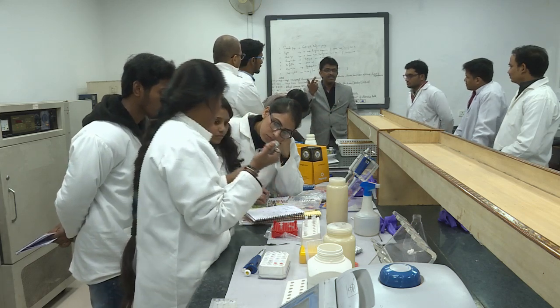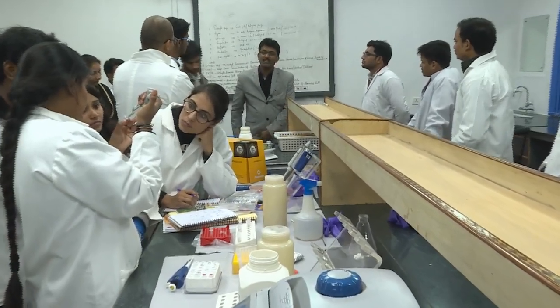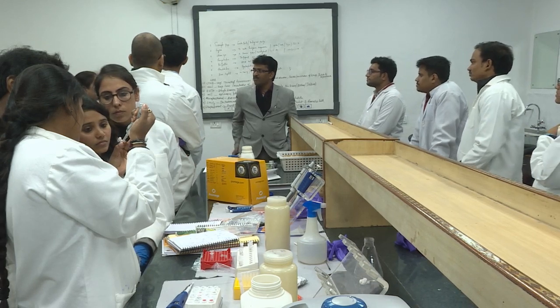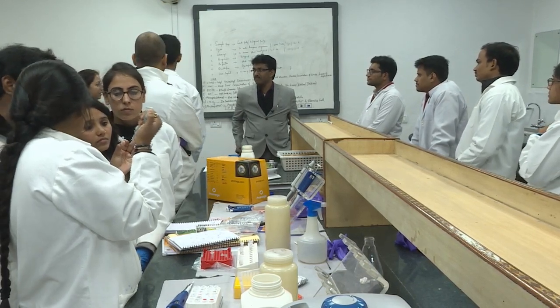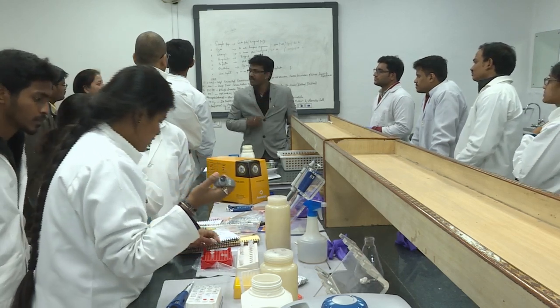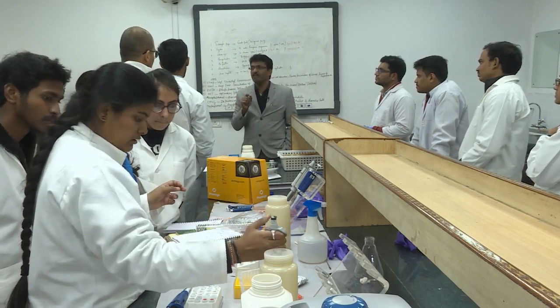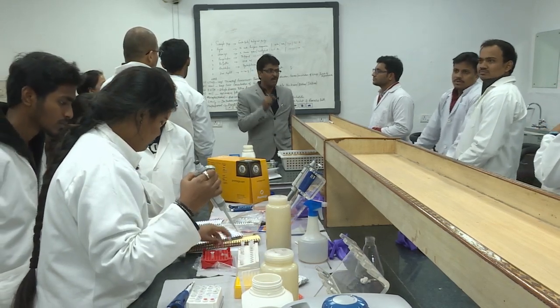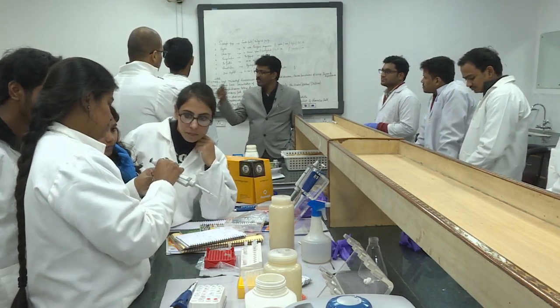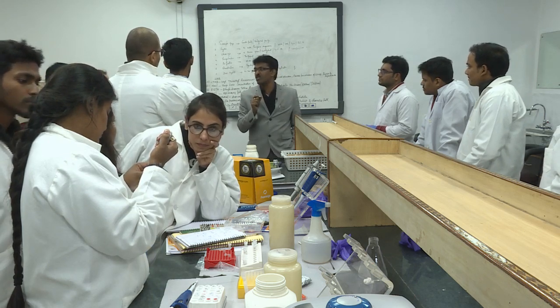So that gives you a complete homogenization of your mycelium. Yeah, young mycelium is of course always preferred for DNA isolation, whether it is oomycetes or fungi, different classes of fungi, maybe ascomycetes, basidiomycetes. The young mycelium up to 72 hours of age is best starter.